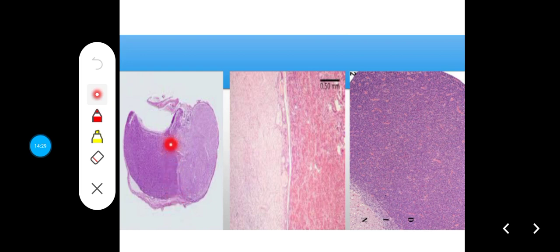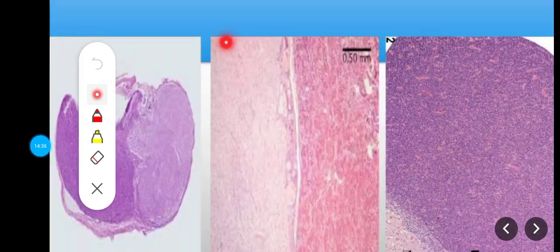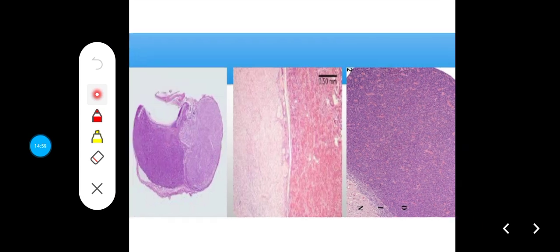And then a thin layer in between them, which is not very distinct, and it represents the pars intermedia that stains poorly. So this is a sharp demarcation. That's how you note the pituitary gland. There is a sharp demarcation between the anterior and the posterior. And then most times you see a kind of stalk, the pituitary stalk.